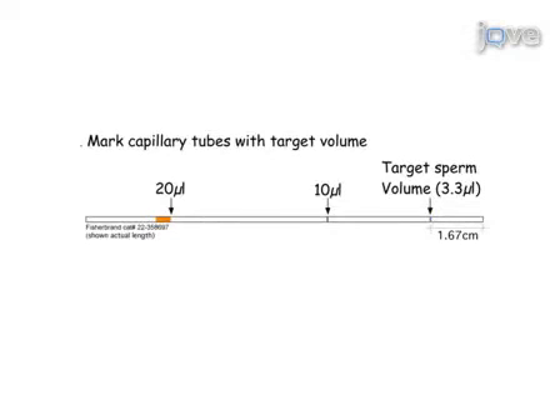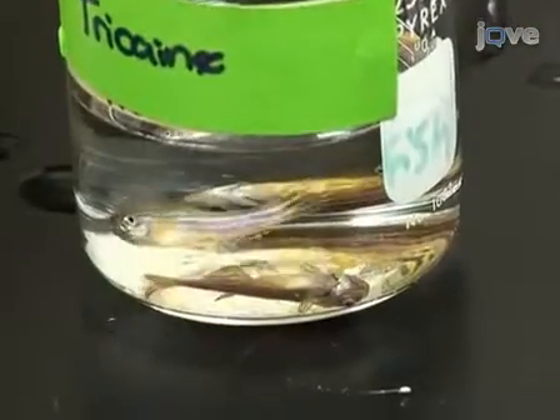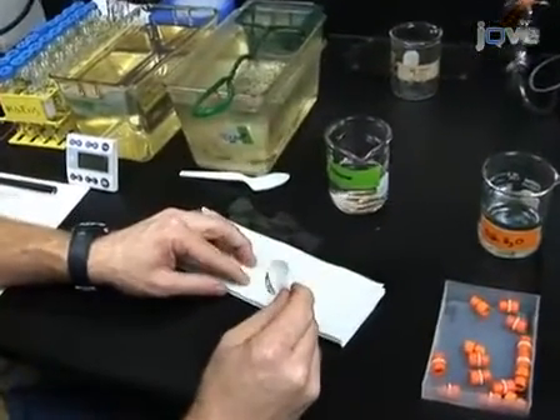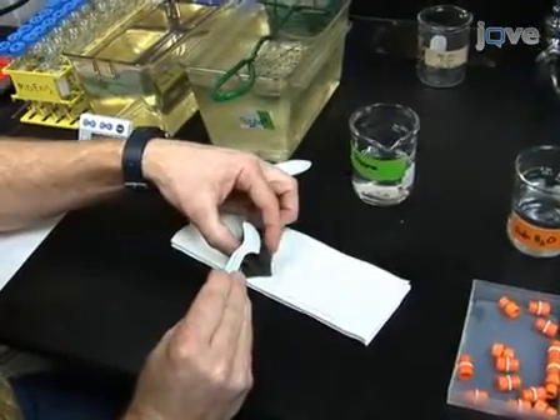To freeze zebrafish sperm, first mark 10 microliter capillary tubes with a lab pen at the level of 3.33 microliters, or about 16.7 millimeters from the bottom. To anesthetize the males, place two to four males in a beaker containing tricane diluted in fish water. The recipe can be found in the zebrafish book. Once anesthetized, lift the fish out of the anesthetic using a plastic spoon and gently blot them dry on a paper towel. Pay special attention to drying the ventral side. Water activates sperm, so it is critical to thoroughly dry around the cloaca.